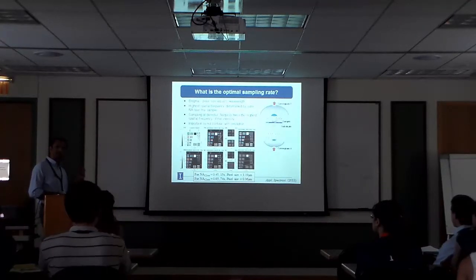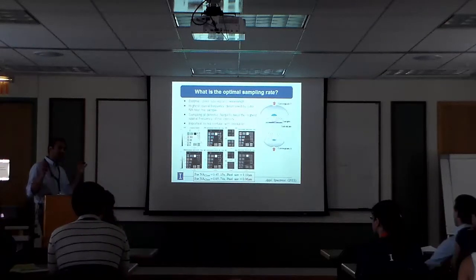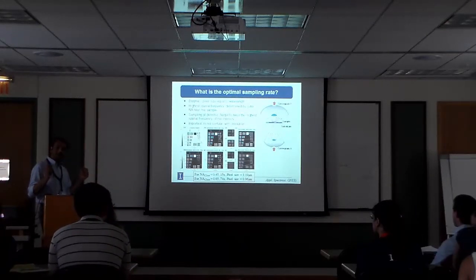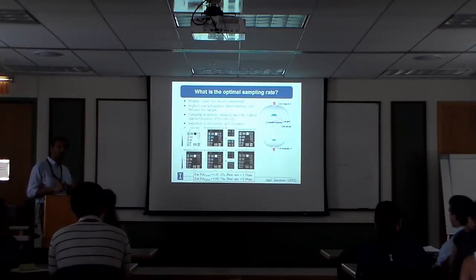And the reason why there is life is because if you think about Rayleigh's criterion, again, we can have a 1-hour lecture on this. Rayleigh's criterion says the minimum distance between 2 point sources and so on. But what it doesn't say is that the 2 point sources have to be spectrally identical, right? If they are not spectrally identical, you can actually locate the centroids of those 2 point sources to infinite precision if there is no spectral overlap, right? If there is spectral overlap, then there's a very complicated relationship between resolution, localization, signal to noise, and the amount of overlap, right?